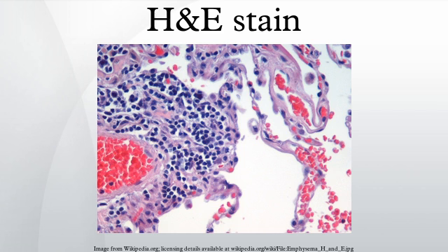The eosinophilic structures are generally composed of intracellular or extracellular protein. The Lewy bodies and Mallory bodies are examples of eosinophilic structures. Most of the cytoplasm is eosinophilic. Red blood cells are stained intensely red. The structures do not have to be acidic or basic to be called basophilic and eosinophilic. The terminology is based on the affinity of cellular components for the dyes.